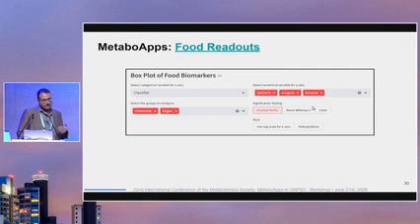In this case, we already have many foods as an example, but I just selected spinach, arugula, and banana as the numerical information. So it's going to look at the quantitative difference. That's why you also need to input the quantification table to work on that.